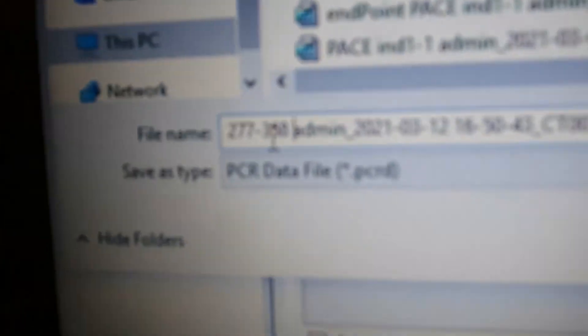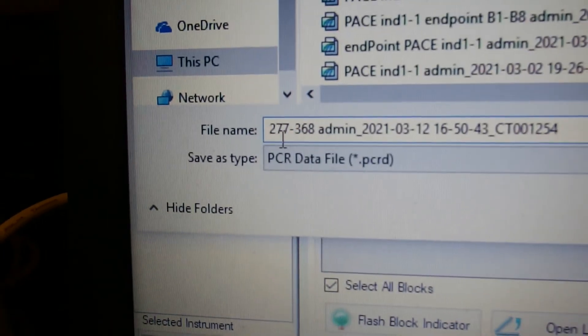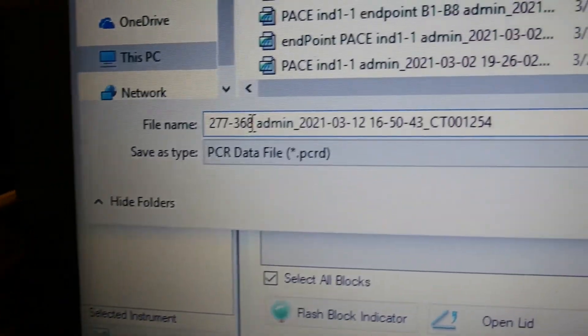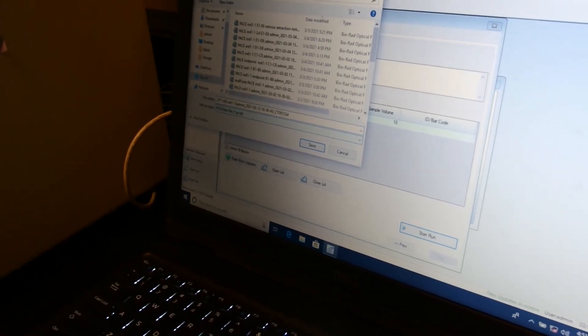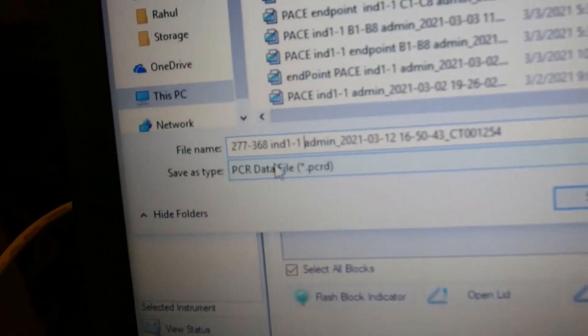Our file name should be our numbers of wells, so in this case it was 277 to 368, and I'm going to just say that we were looking at IND1 dash one. That'll be enough information that we can easily understand what this file is.